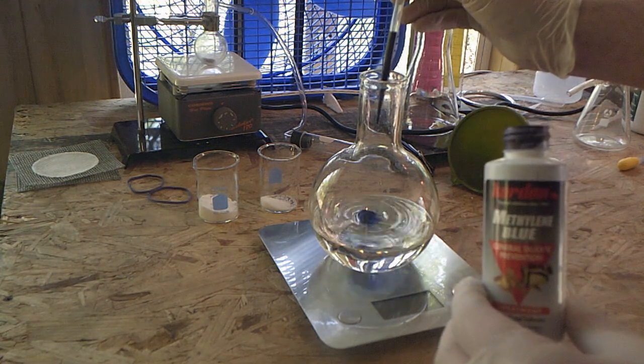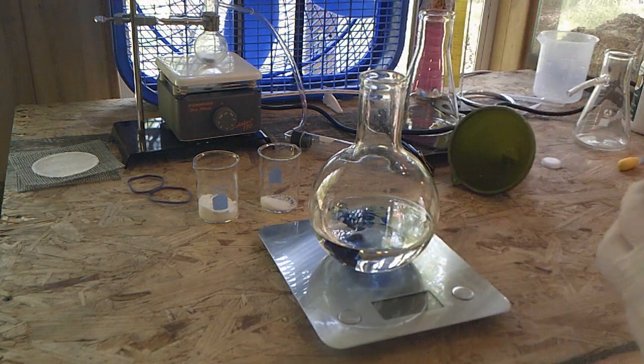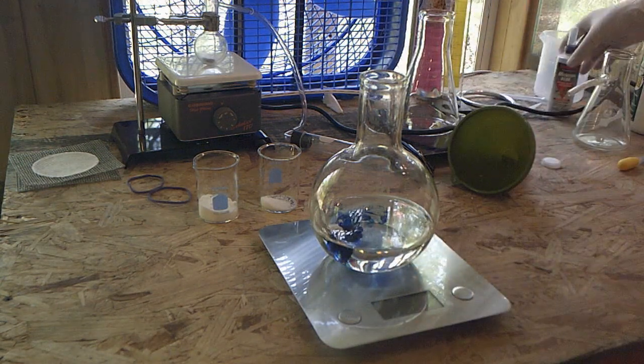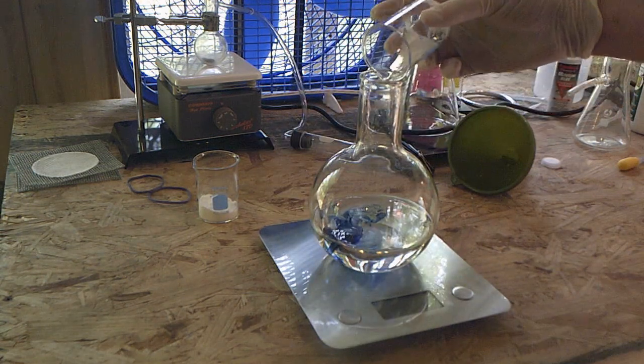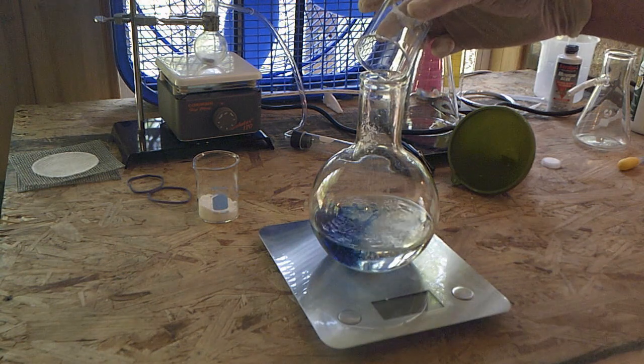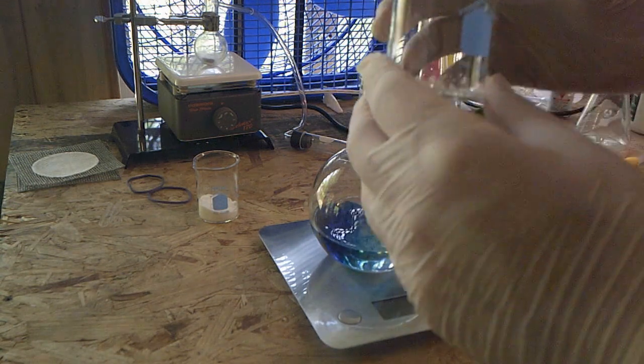So we're going to do just 4 drops of methylene blue into our solution. And now let's go ahead and add our base, our sodium hydroxide. There you go. Now, this is a good chemistry technique.